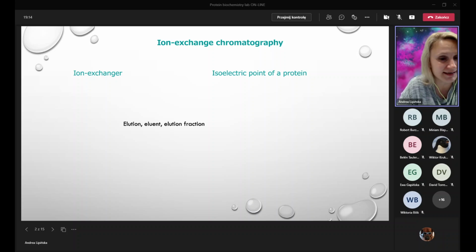So I want to ask you, what was your yield of lysozyme? Do you know the concentration that you got for the best fraction, the concentrated fraction if you concentrated it? You will have to put it in your report, so it's good to know it. So group 5, what's your lysozyme yield? Silence. Have you measured? I don't have it calculated directly, but from looking at the calibration curve, I can guess it's around 0.2 milligrams per milliliter. Okay. And you measured the protein concentration by spectrophotometer? Yes, it's from the readout from the array when we had the calibration curve. Was this by BCA kit? Yes, the BCA.